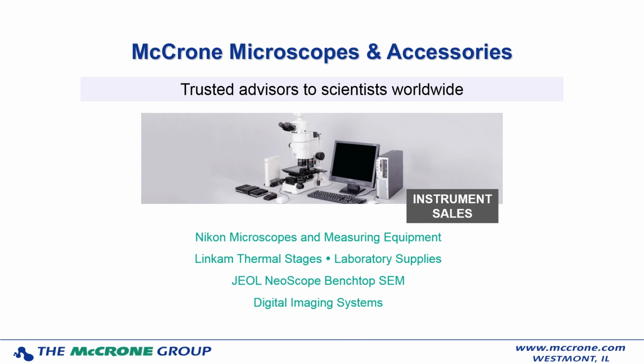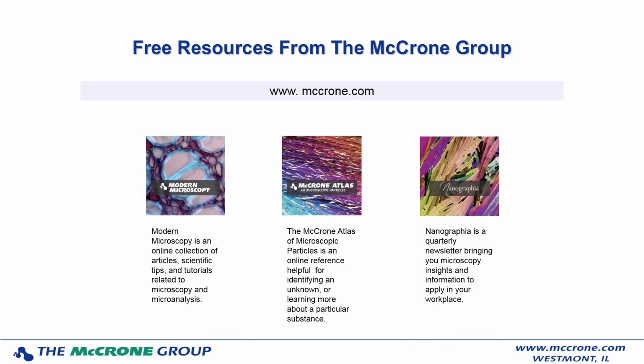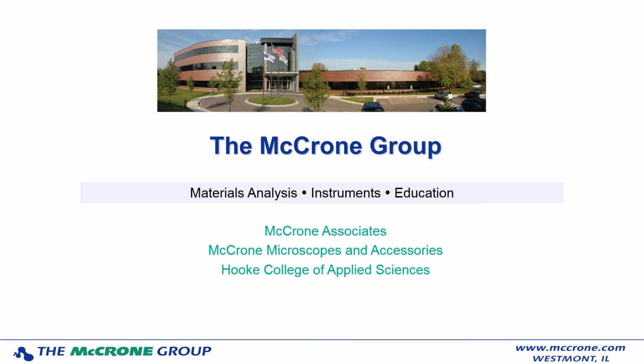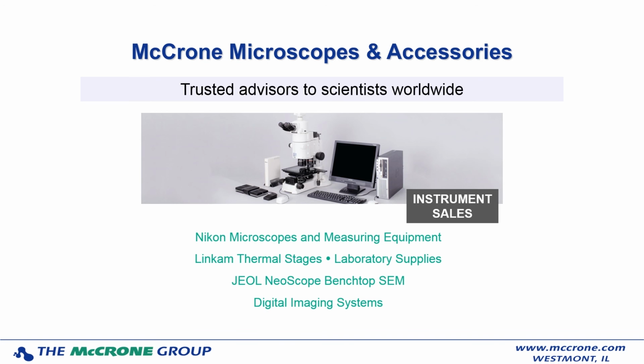I joined a little late. I do PLM for fiber identification. I'm new to NDIC. Is it something software-based or just accessories-based? It's accessories-based. It's something you would use in the microscope to take images of your samples. It's actually pretty good for fiber work, especially for looking at the surface structure of natural fibers. Do you have a particular brand of microscope that you use? The microscopes I have in my office are Olympus. My polarizing light microscope is the Olympus BX51.